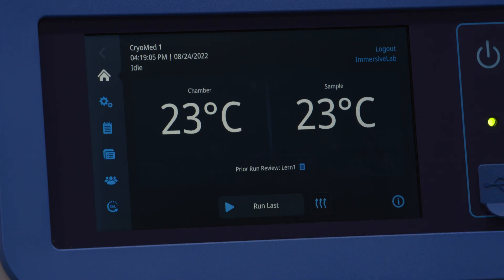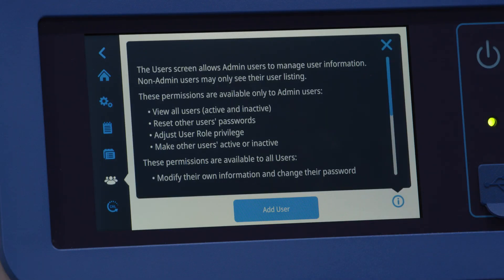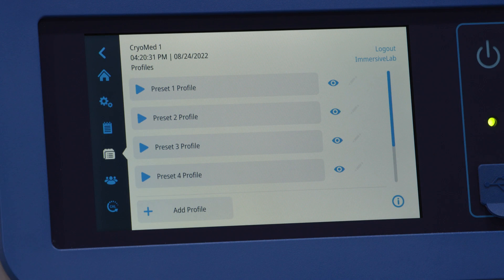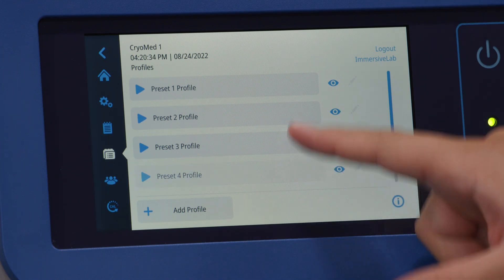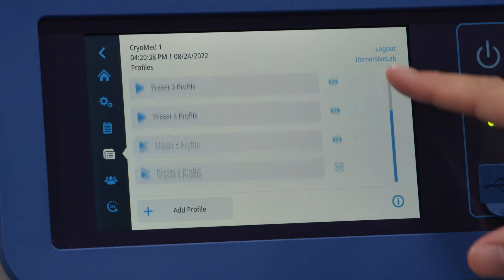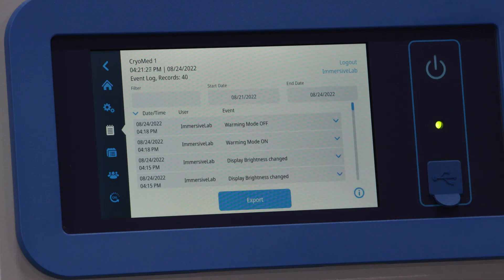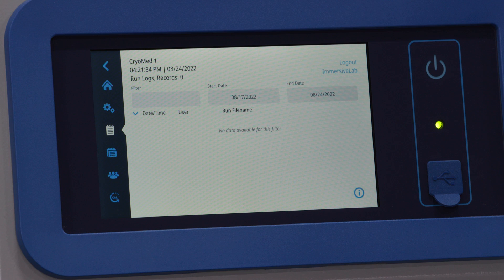Some of the convenient features of the UI include the ability to create three levels of usability, with roles for an admin, user 1, or user 2. It also comes with six preset freezing profiles, based on sample type and volume, with room to include up to 14 more custom profiles. Most importantly, your lab or manufacturing facility can now export compliant event and run logs using the onboard USB.